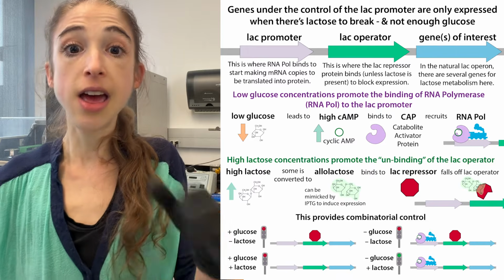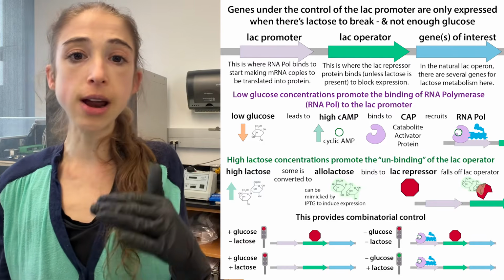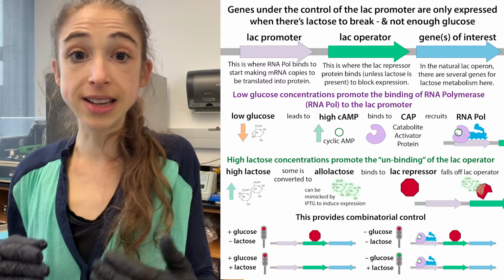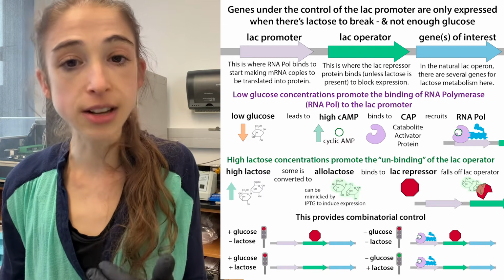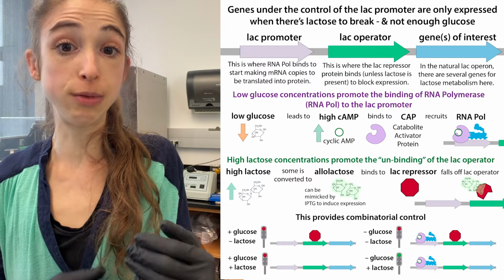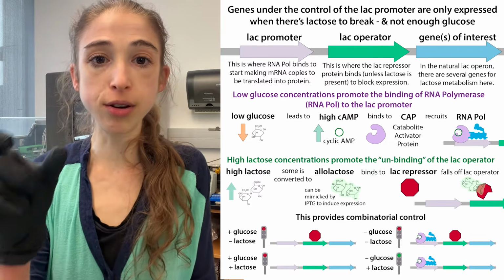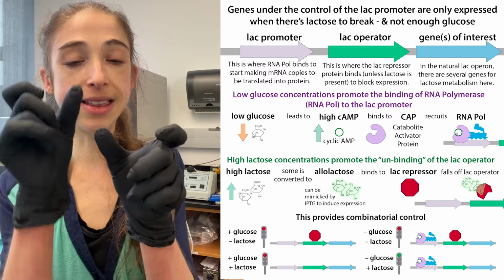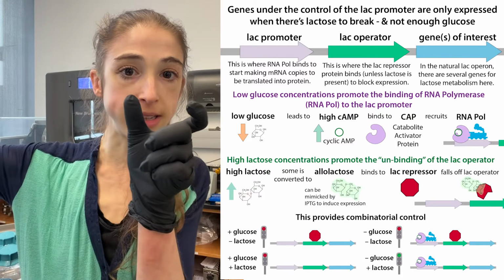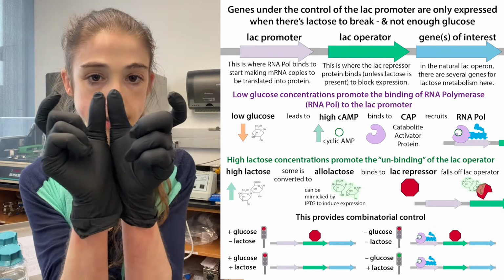Now these bacteria are going to be like, oh, okay, under these conditions, we're going to be repressed. If there's glucose around, if there's no lactose, we're not going to make the genes that are in front of us. But if we make the conditions so that there is lactose around and there isn't glucose around, or if there is something that looks like the lactose product that is responsible for controlling things, then the bacteria will start making our protein, because our protein is in front of the instructions for that machinery. Basically we swap out all those lactose breakdown components and stick in our gene of interest, or the coding sequence for the protein that we want to make.